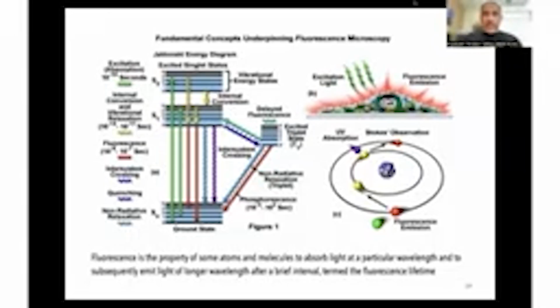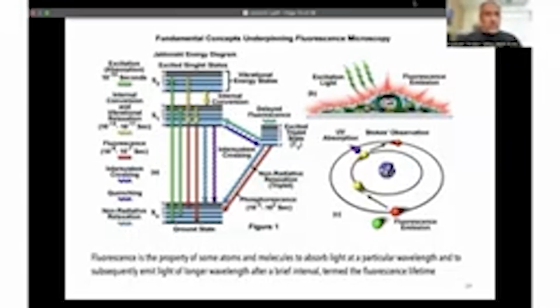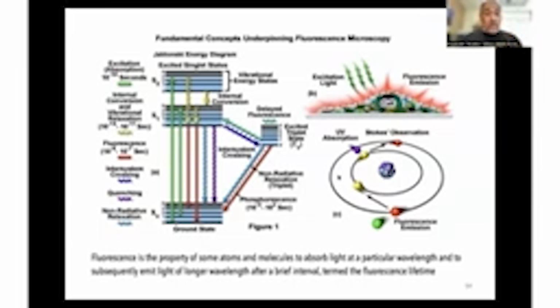The other interesting thing about light microscopes, about microscopy, really came from the idea that you are able to hit something that is fluorescent in a cell, or put something fluorescent in cells, hit it with light, and then measure the fluorescence energy that is emitted, right?